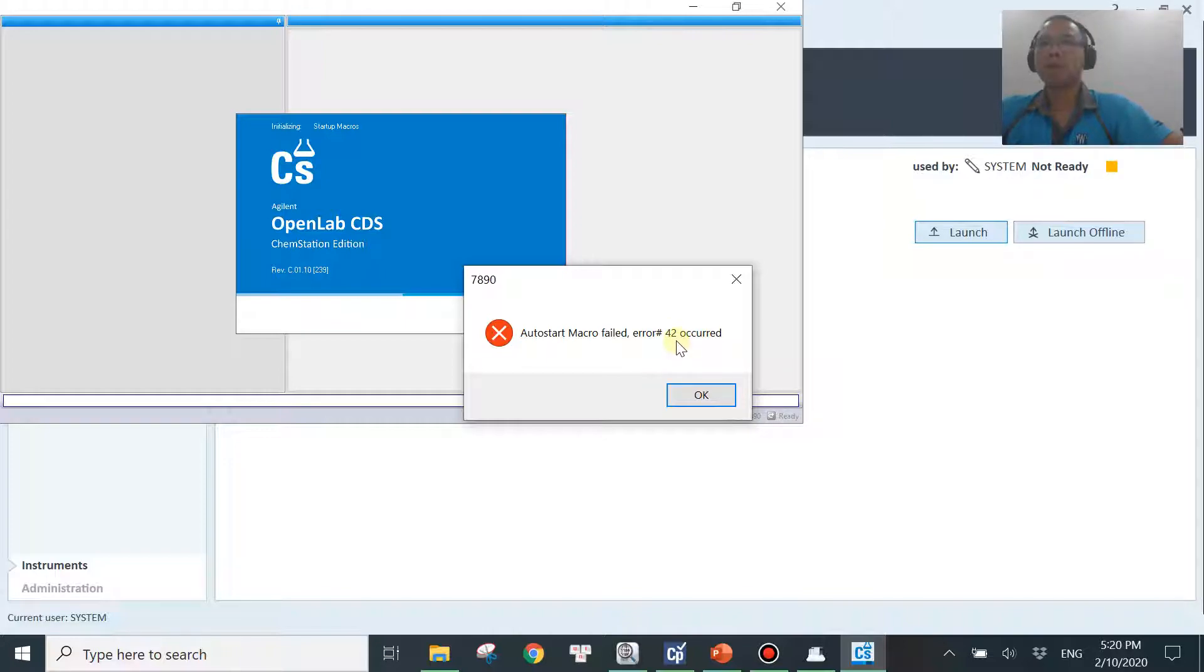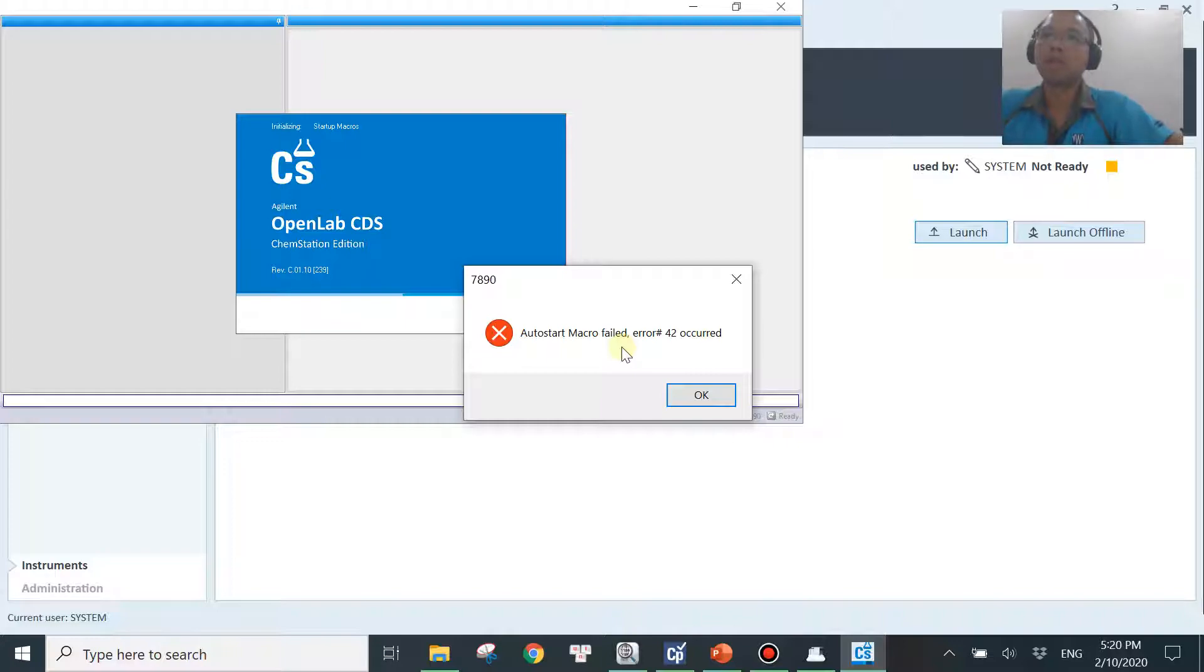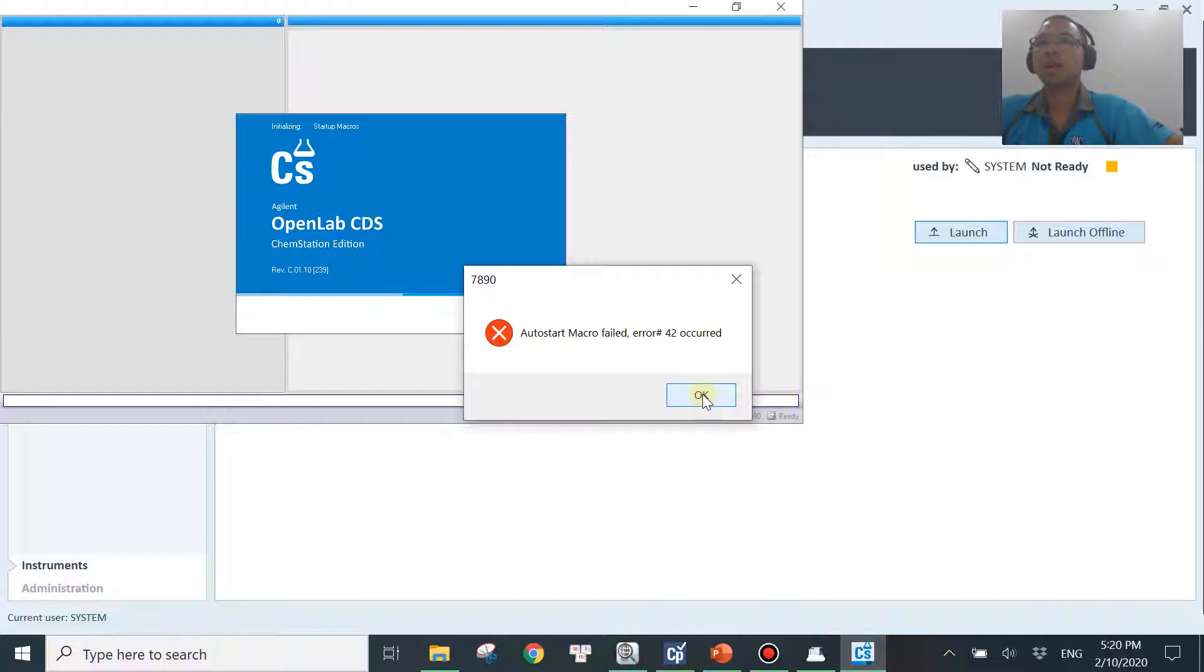But believe me, you don't need to care about this number actually. What you need to look for is auto start macro fail. So that's good enough for you to know what's wrong and to fix it, which I'm going to show you in this video. It's very common that you see errors 999, but again, you don't have to worry about that number. So let me hit okay and I will show you how to fix this problem.